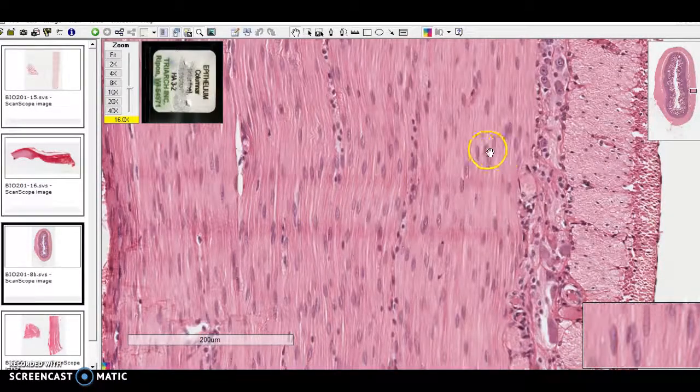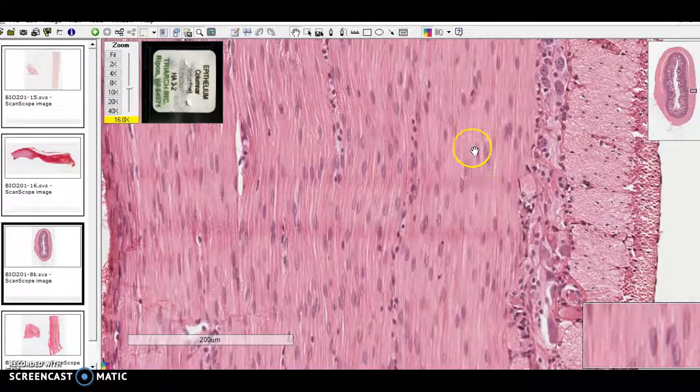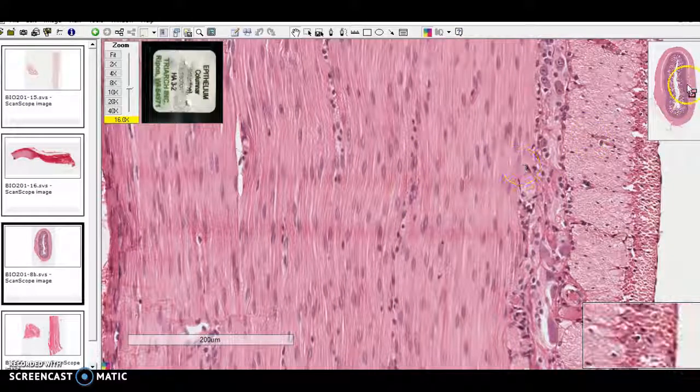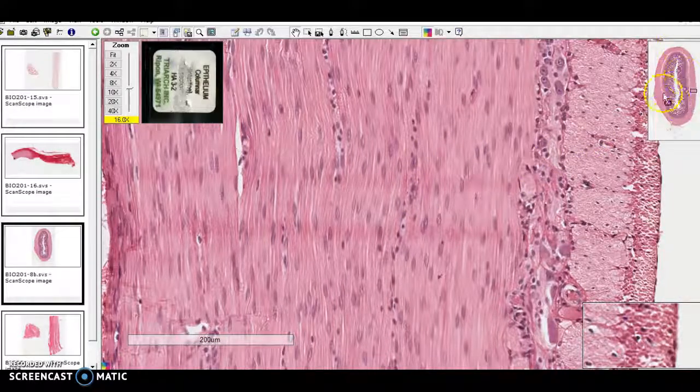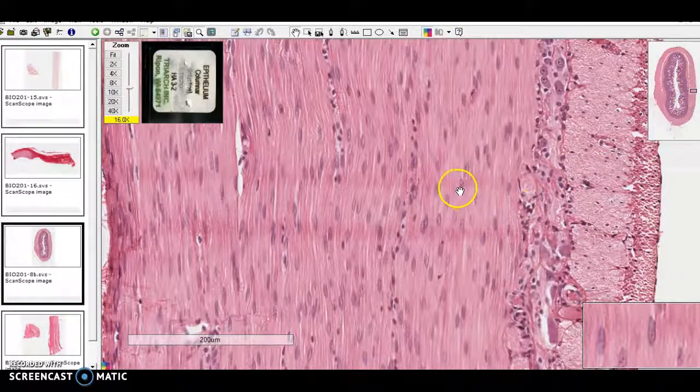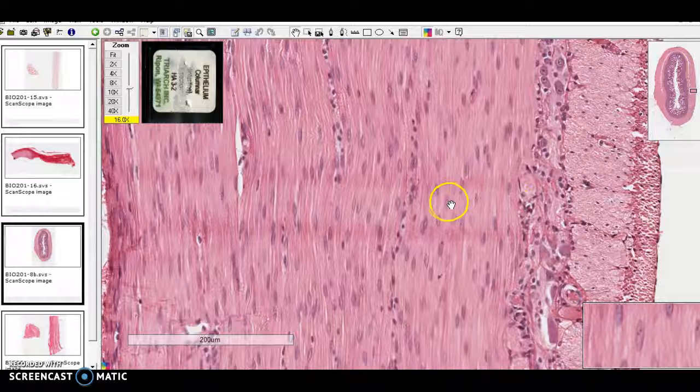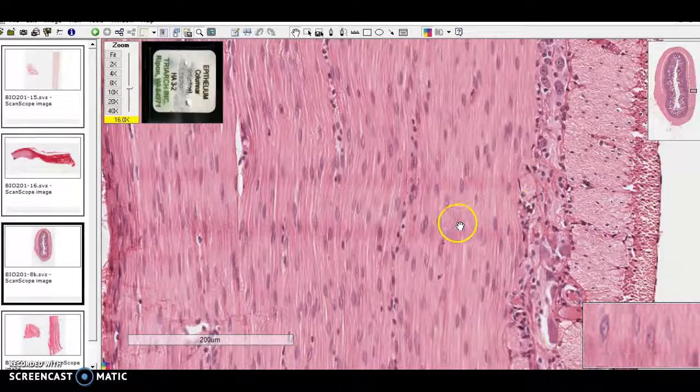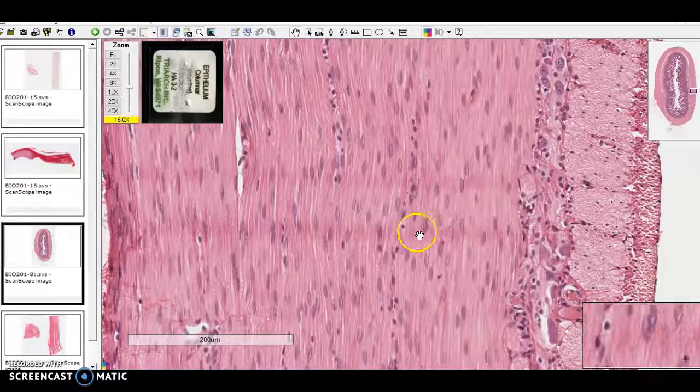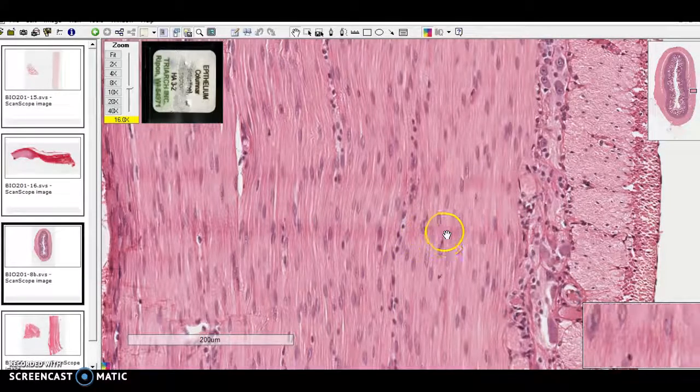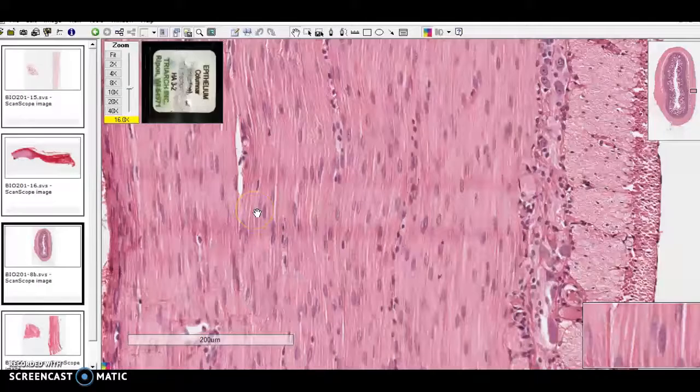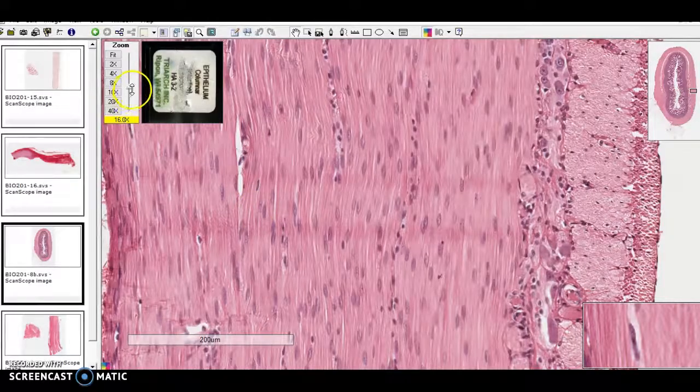Here you see, this is smooth muscle coming from the small intestine. You see much more prominent nuclei, more cytoplasm and less of a fibrous look.